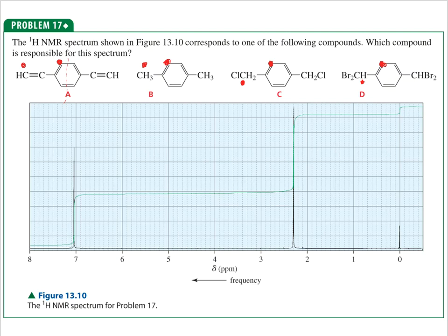And if you look at the NMR spectrum, there's only two signals that are listed, right? And that is why. So the number of signals will not help us to determine which one of these is the best match. So 0 is the TMS, and TMS, remember what that stands for. And then here is one signal, and then here is another signal. Those are the two. All right. So the next thing would be, can we use the location of the chemical shifts to figure out which one that we actually have? Well, let's see.